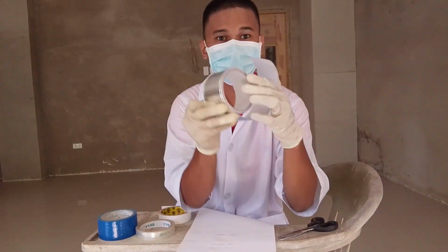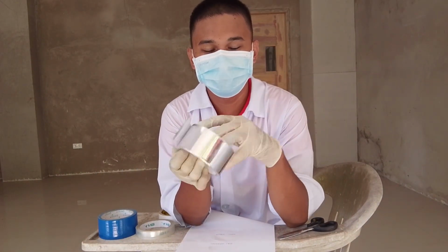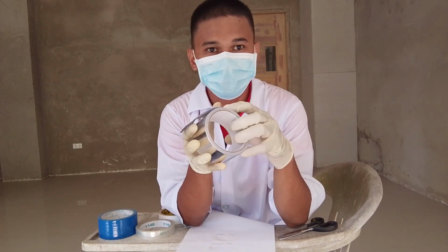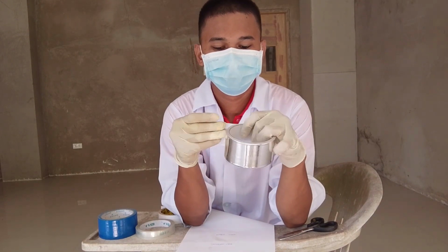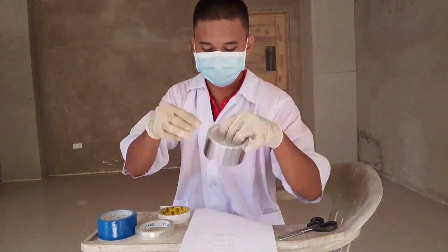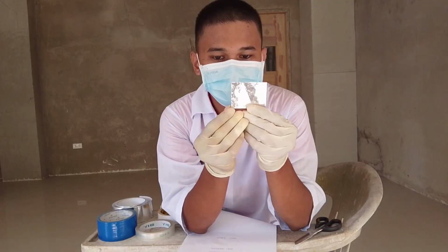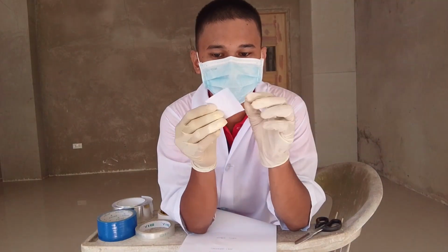Next is the aluminum foil tape. Aluminum foil tape is also an adhesive tape, and is commonly used for heat resistance and insulation. I will now get a sample. I have here the sample. The size of this aluminum foil tape is 2 by 3 inches.